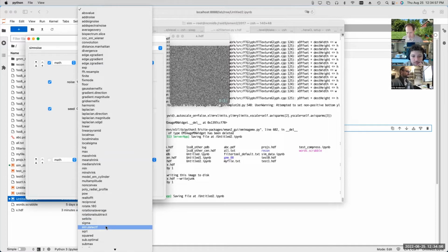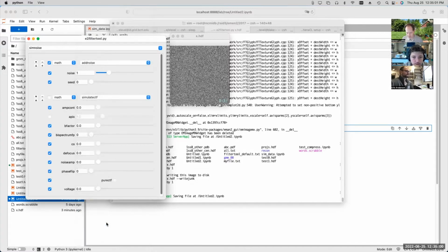You unfortunately will run into that when you have any project like this, which is kind of modular, and 25 people have worked on it over the years, that someone doesn't realize something exists, so they add it themselves. There are also issues with Pawel Penczek when he was working on Sparx, which is jointly distributed with EMAN2.